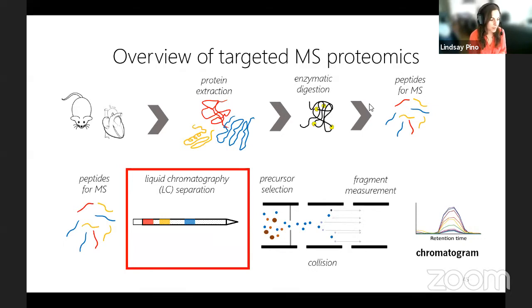Could I use non-tryptic peptides? Absolutely. They might be harder to see because part of the reason everybody loves using trypsin is because it confers a charge to the peptide sequence. But if you have a precursor that you see by mass spectrometry, you can absolutely use a non-tryptic peptide.